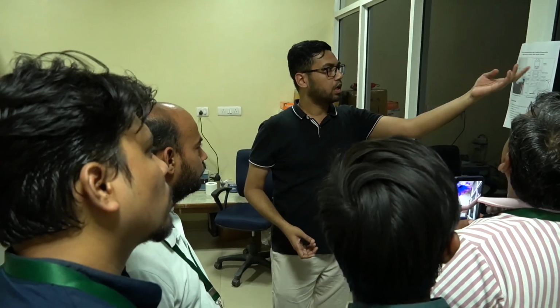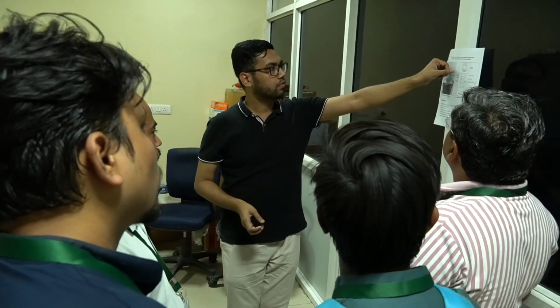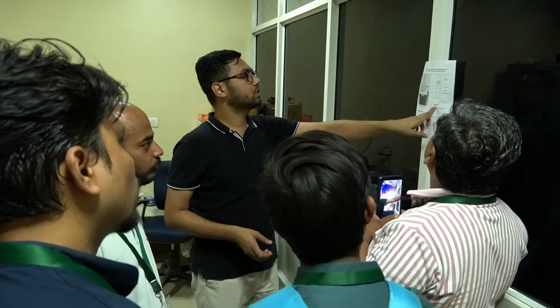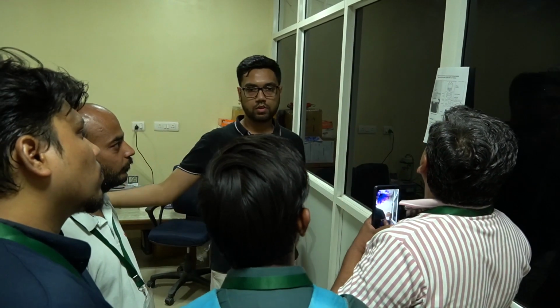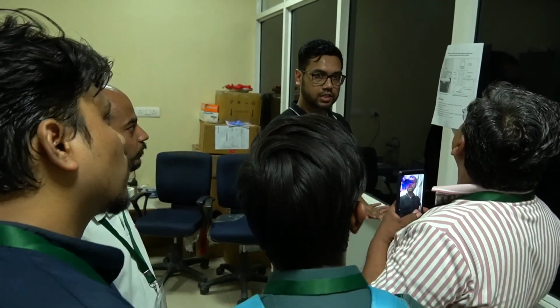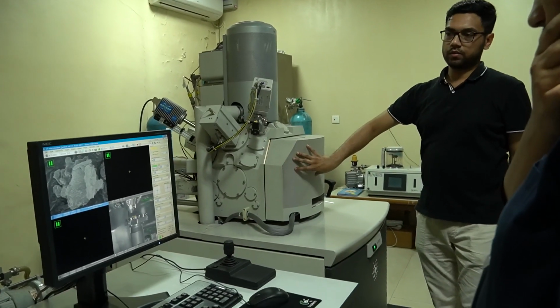Based on the electromagnetic effect of these lenses, we confine those electrons, and after passing this section, finally the electrons are injected onto the specimen, the sample, and electron-matter interaction takes place. We get secondary electrons, backscatter electrons, like secondary signals, and we capture those signals and analyze them on our computer.